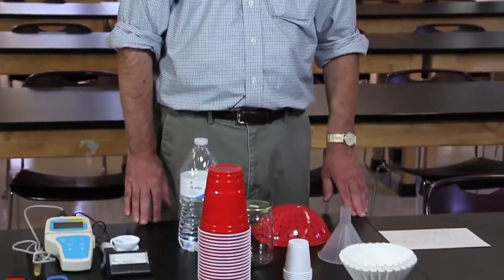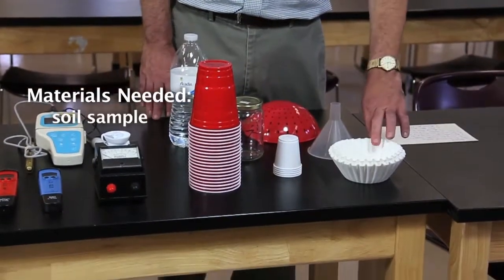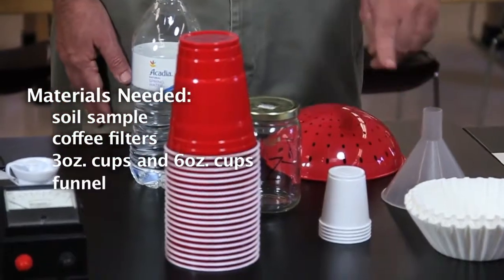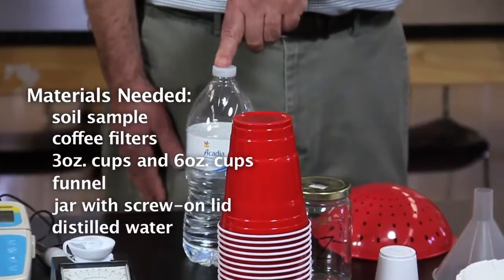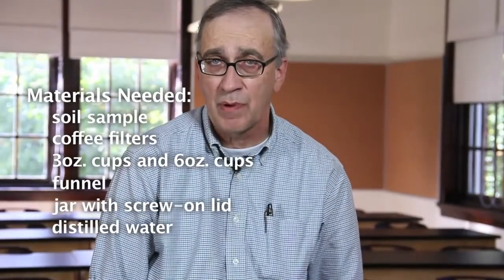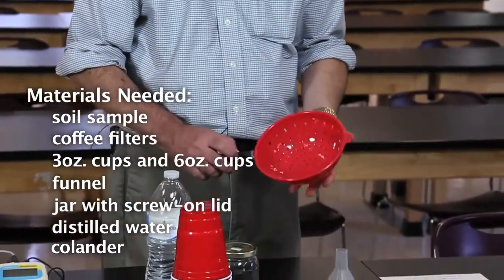It has a number of pieces of equipment and small items that you need in order to do the test. Some of these you can get at the grocery store, some you may have at home already. For example, here we have some coffee filters, 3-ounce plastic cups, 6-ounce plastic cups, a funnel, a pickle jar with the lid — we need to have the lid. Distilled water would be best, but spring water that doesn't contain any additives, flavor, or coloring would probably be okay. And then we have a colander here for sifting soil with.